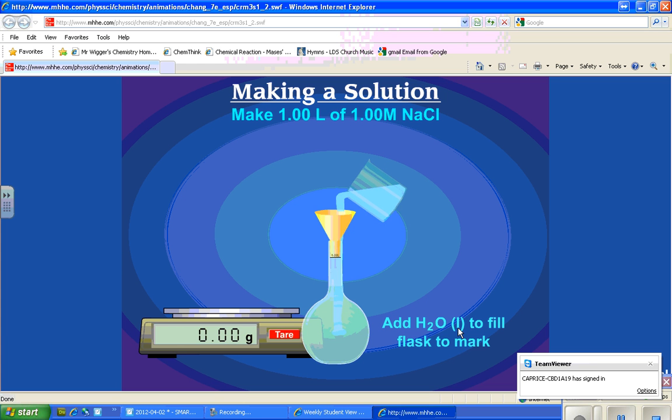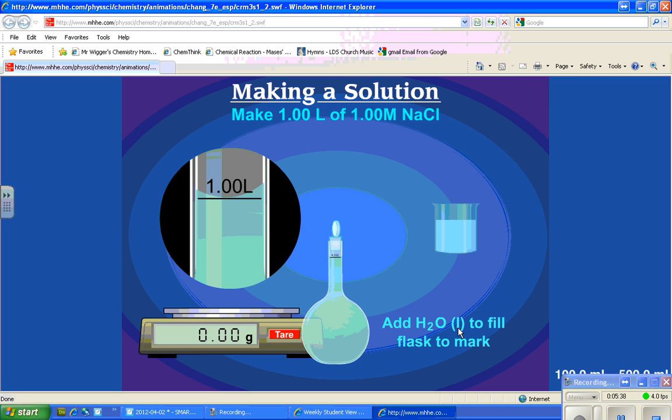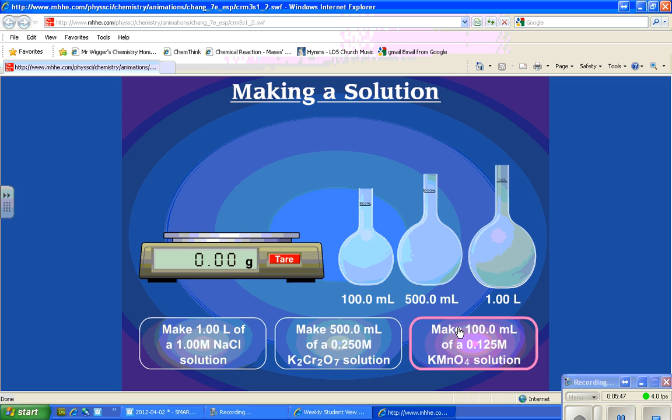Once it's all dissolved, we can go ahead and fill it. But from the beaker, we only want to fill it up partially, just a little bit below the line. Then we take a dropper, and that gives us more control so we don't overshoot. You can see the bottom of the meniscus was right on the line. From that, we know that we've got exactly the 1.00 liter of solution, exactly the right amount of stuff, and we've created as accurate a solution as we can possibly make.